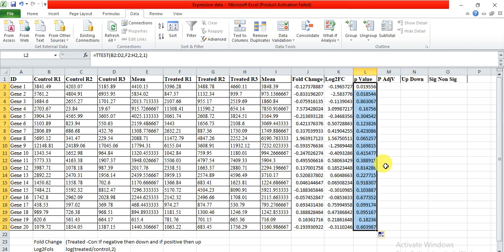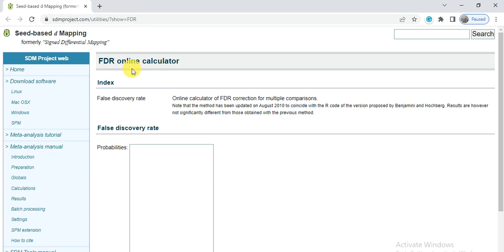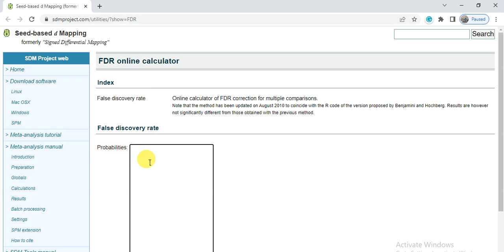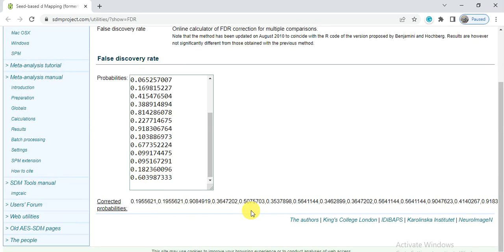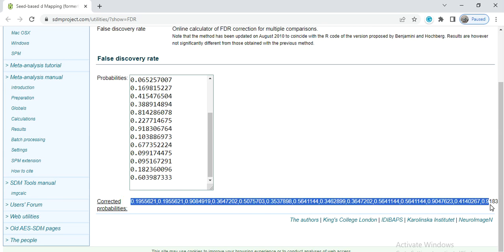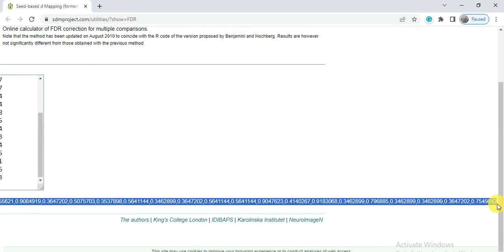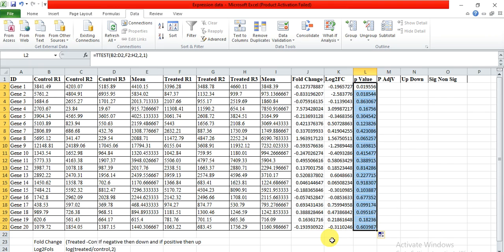Now we need to adjust this p-value to remove the FDR. Copy these p-values and go to the FDR link. The link of this website is available in the video description. Go to that website, paste your p-values in the box, and then simply click on Calculate. Wait a little and now we have got the adjusted p-values or corrected p-values. Simply copy all those p-values.